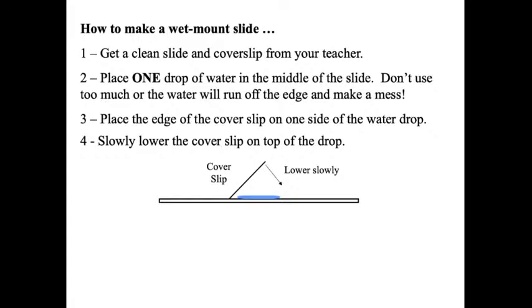Then put your cover slip at 45 degrees on top. Then slowly lower it onto your sample so that you do not have any air bubbles.